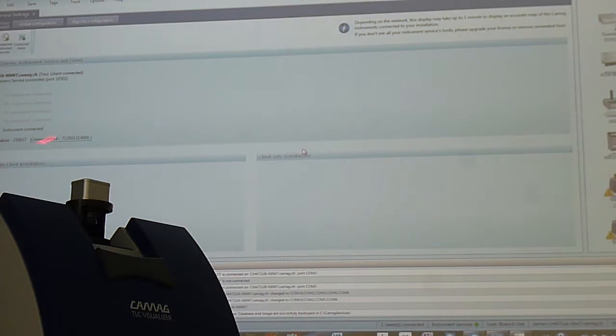Now it's green, and it should over here. We have a second visualizer because this visualizer here is another visualizer. There is a different format of the serial number now. We have this at the end.